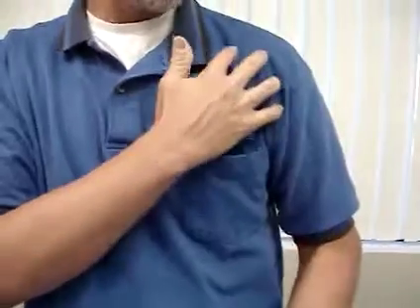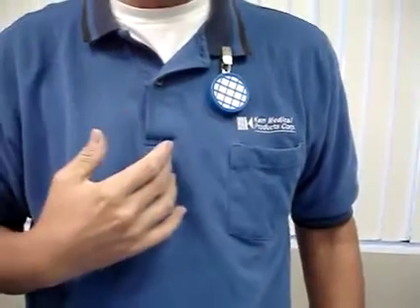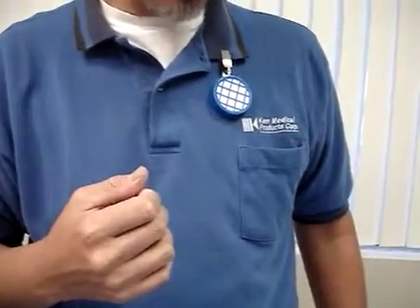Very critical. The monitoring badge can be used on the person. You're going to want to put it on the lapel, in the breathing zone area here, whether it be near the shoulder or near the neck or the collar or so forth, or your lab coat, whatever the case may be. When you're working with the badge on, again, be careful not to touch the badge with your fingers that you may have some chemicals on them. That will definitely skew the numbers.